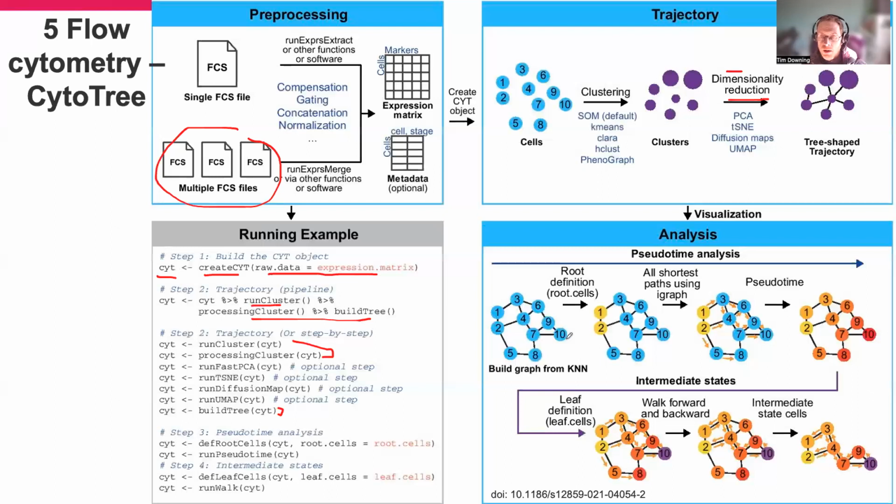route these different clusters as shown here for 1 and 2, and look across the graph to identify the shortest paths between different clusters. What it'll try to do is track paths from its root 1 and 2 to the furthest point in this cluster.